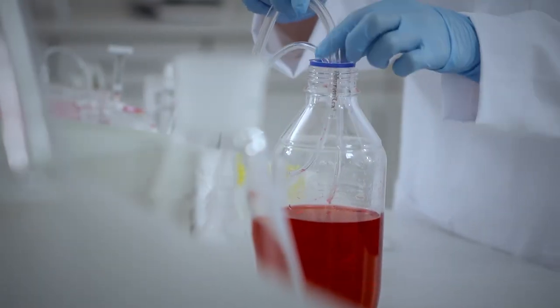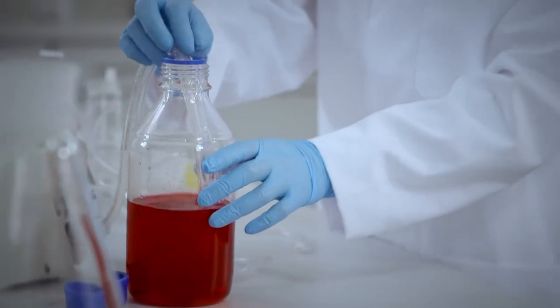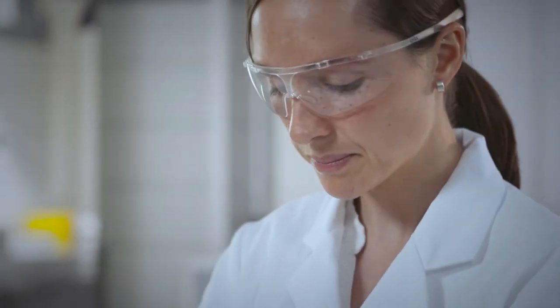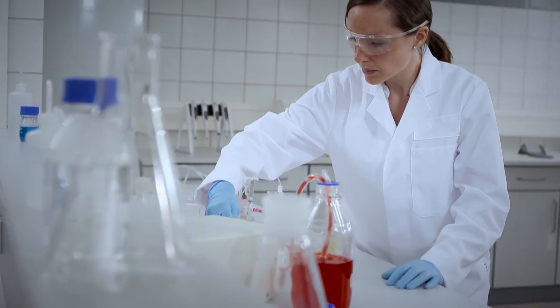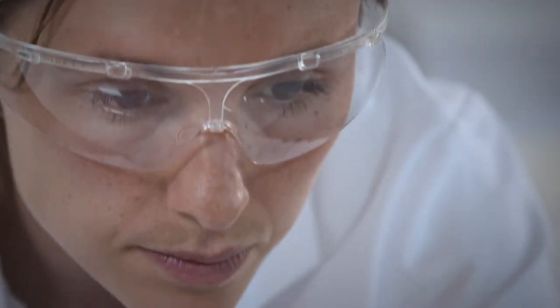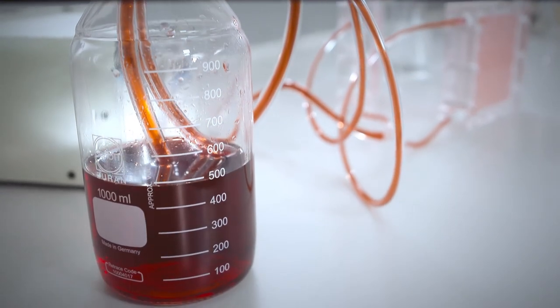At this point, place both outlet tubes and the inlet tube together at the sample reservoir. After you have attached the filtrate tubing, you can switch on the pump to start the concentration run. The sample now recirculates through the two Vivaflow 200 cassettes while the filtrate is collected in a separate vessel. Since the sample is red, you can watch the color turn darker as the concentration of the sample increases.